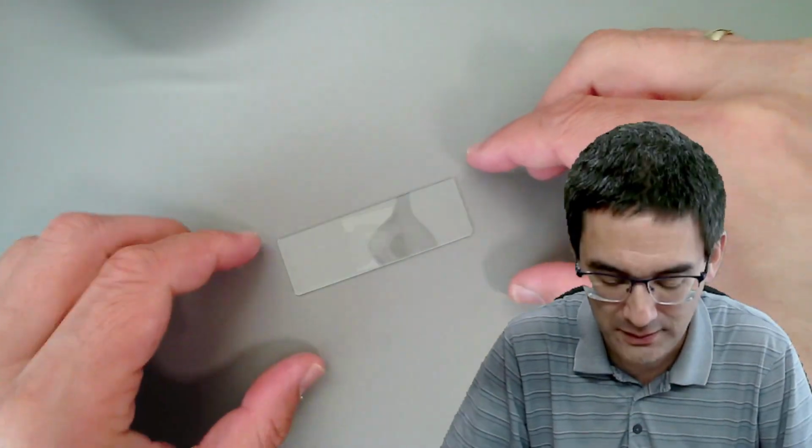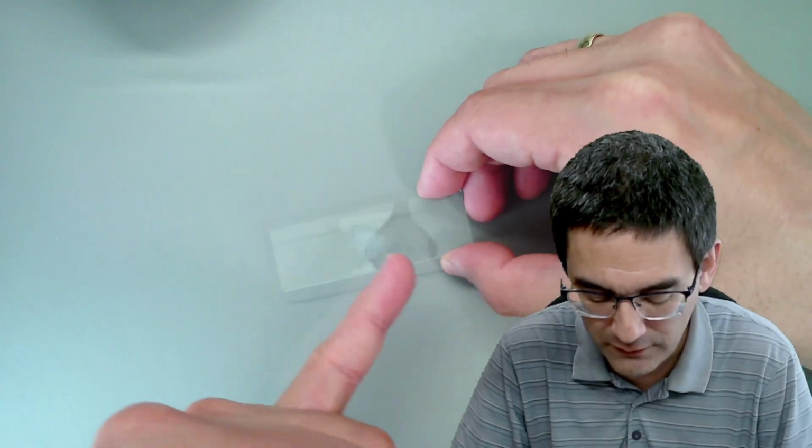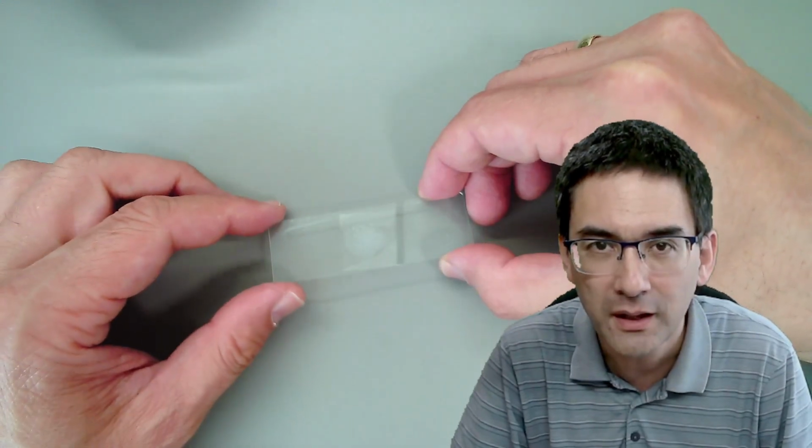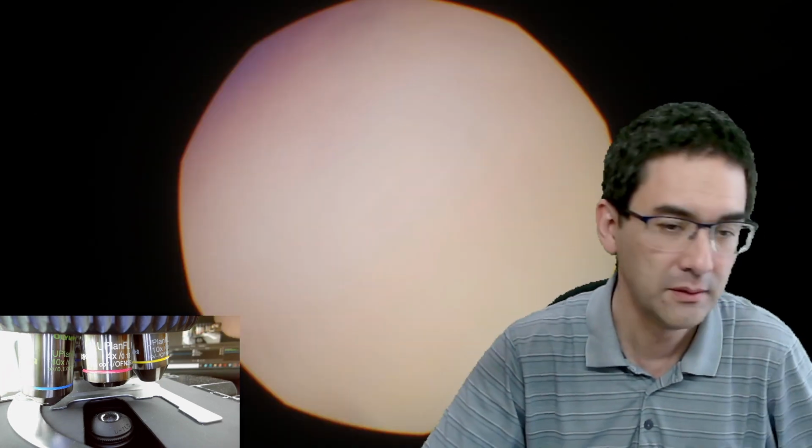I'm also going to refocus it a little bit so that you see it better. Yeah, it's difficult to see, so there's almost nothing on here. Very thin film of yogurt, and I'm going to put it under the microscope. So let's switch over to the microscope view, and let's turn on the lamp of the microscope.